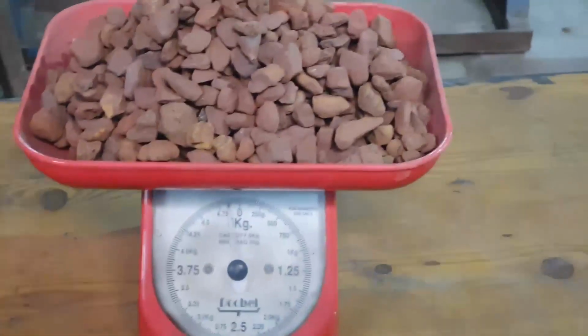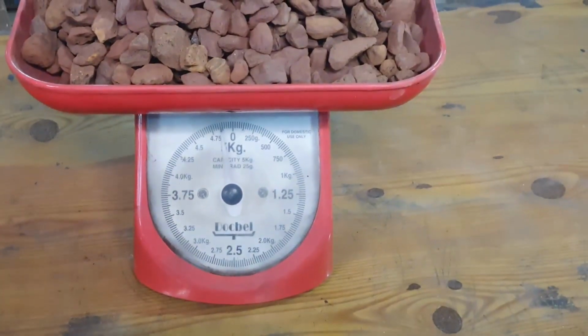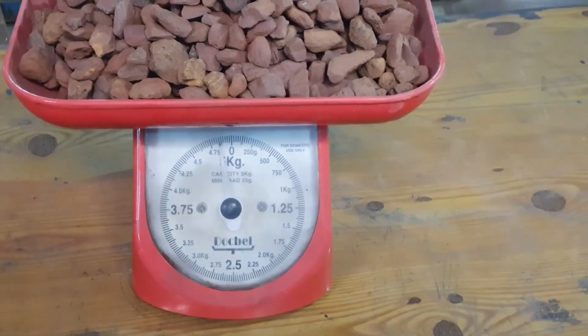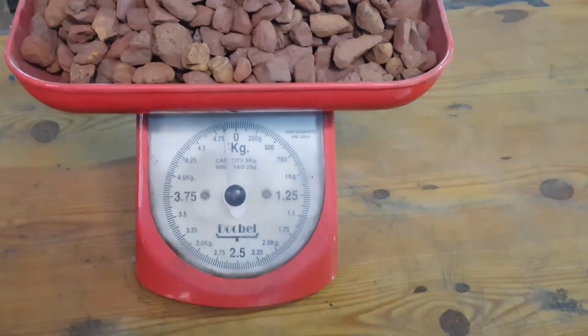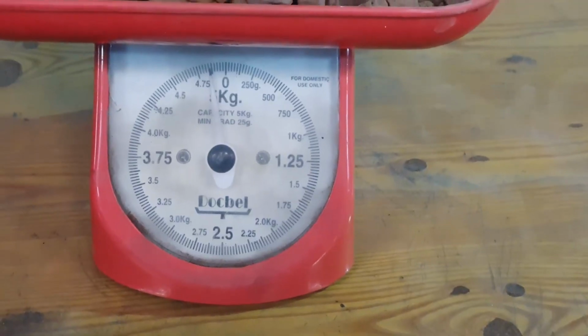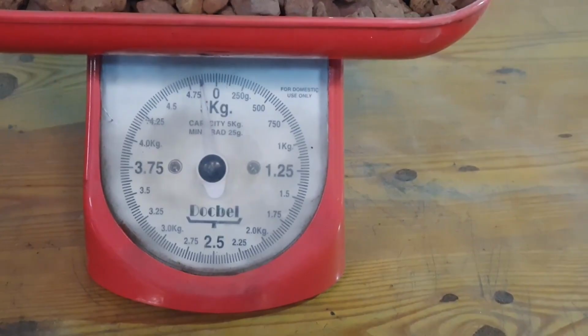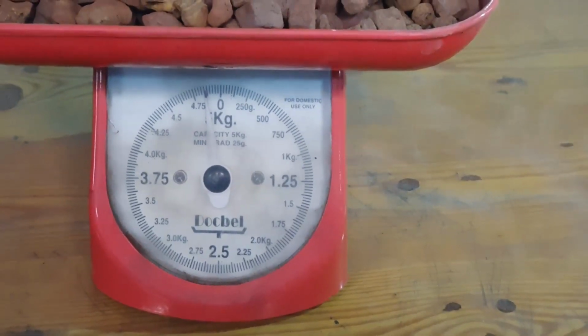Now this is the weight fraction retained on the 10 mm screen, means plus 10 mm. The total weight is now 4.85. This is the weight fraction obtained, that is of plus 10 mm.